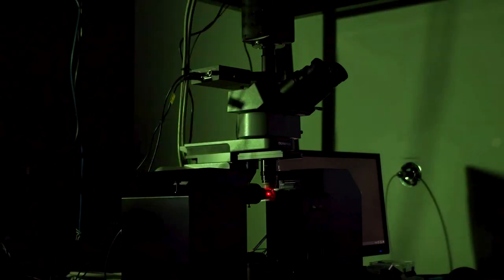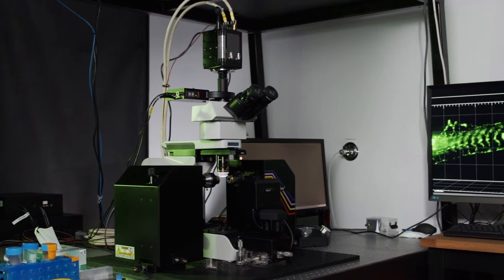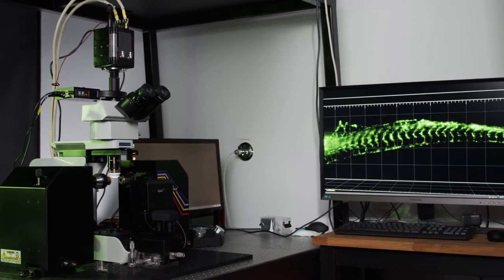We are about to show you in the next 5 steps how you can easily acquire image data sets with the new generation light sheet Alpha3 microscope system.